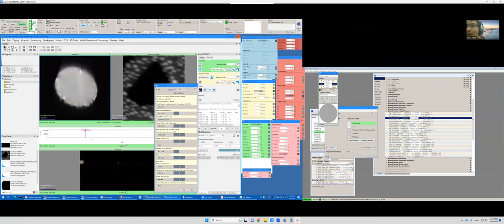Okay, after the monochromator slit is in, you want to take the VOA out and MOA in and look at the edge of the MOA. You want to make sure the edge is clear. If it is not clear, how do you deal with that? You want to close and open the slit, try to find a good position where the charging is not so bad.